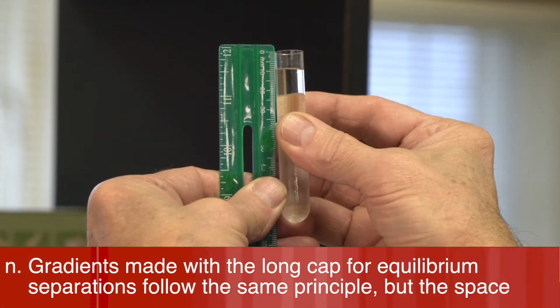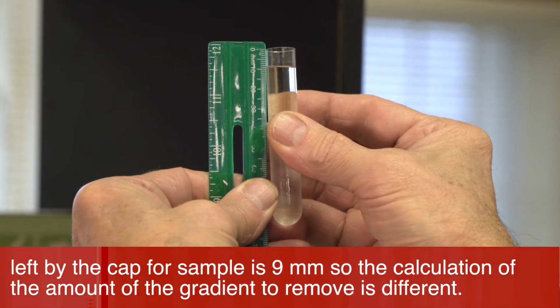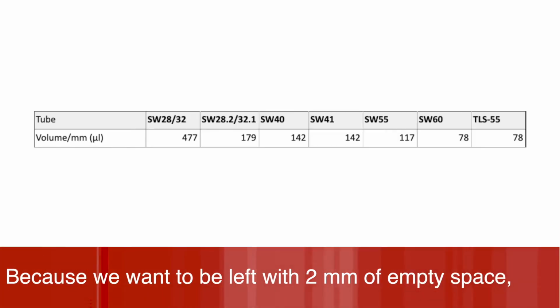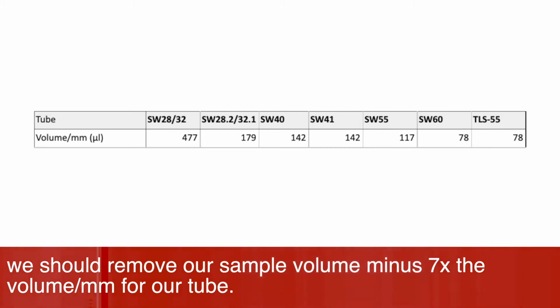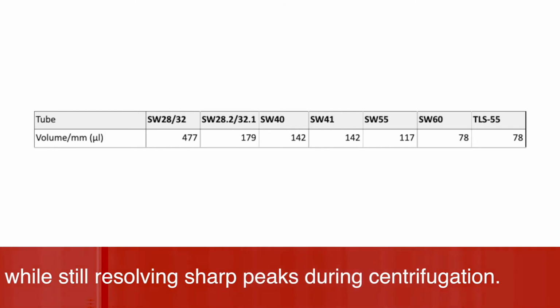Gradients made with the long cap for equilibrium separations follow the same principle, but the space left by the cap for sample is 9 millimeters, so the calculation of the amount of the gradient to remove is different. Because we want to be left with 2 millimeters of empty space, we should remove our sample volume minus 7 times the volume per millimeter for our tube. The nature of equilibrium gradients allows any sample volume within reason to be layered on top of the gradient while still resolving sharp peaks during centrifugation.